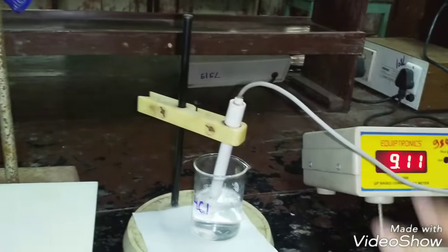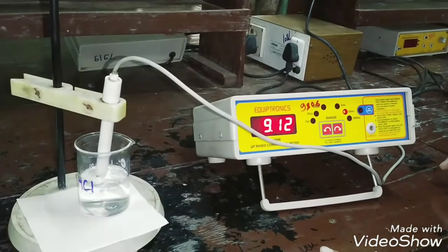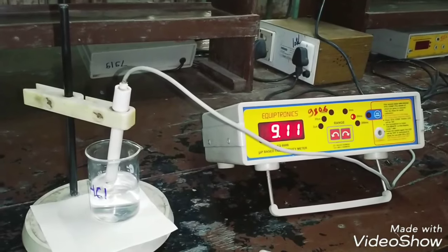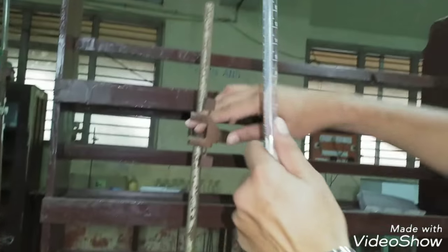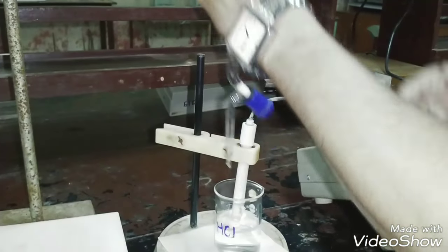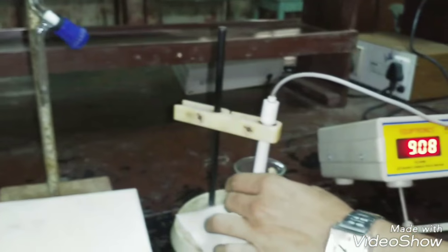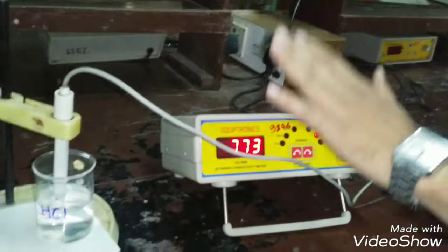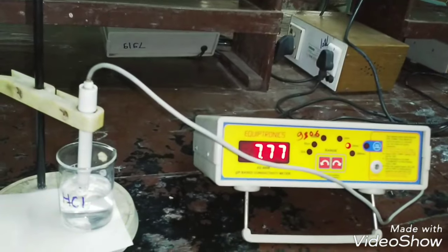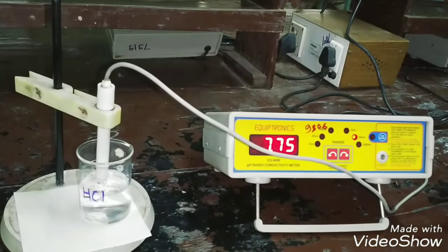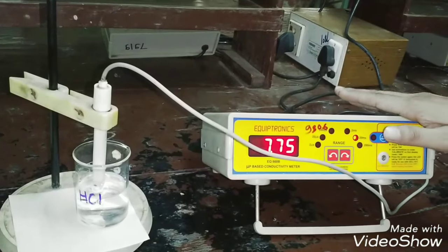During conductometric titration, the end point of titration is determined by measuring the conductance after each addition of the base. So, we add continuously ml by ml base solution to the acid solution. And after each addition, conductance is measured and recorded. We see that the conductance gradually goes on decreasing and this is because the HCl is highly ionized acid and during acid base titration, Na+ replaces the H+ ions which is slow moving ions and that's why conductance goes on decreasing.